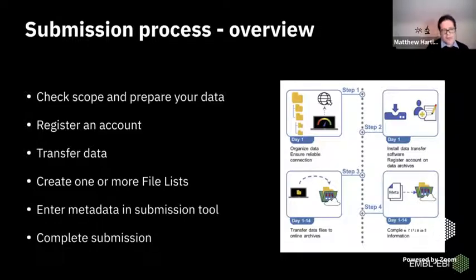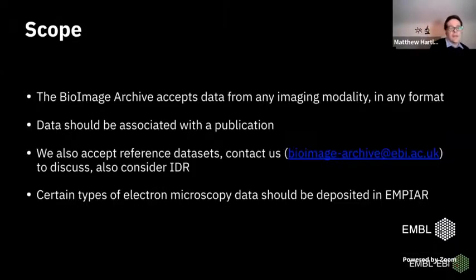So the first stage of that, checking that you're submitting data to the right place: the BioImage Archive takes data from any imaging modality. We're not specific to light microscopy or light and electron microscopy. We will take anything that's bioimaging in any format.